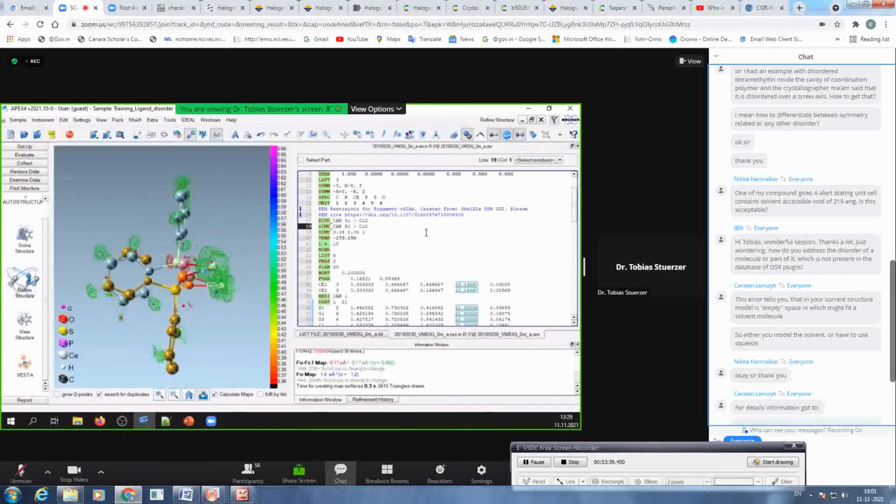I don't want to spend too much time with the restraints here. I just want to put in a FLAT, underscore to refer to the residue CAR, so that these disordered parts are put in a residue. If you put this underscore CAR, everything you write behind will only apply to this residue. Both are residues.